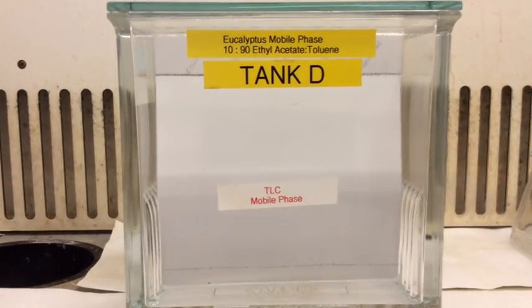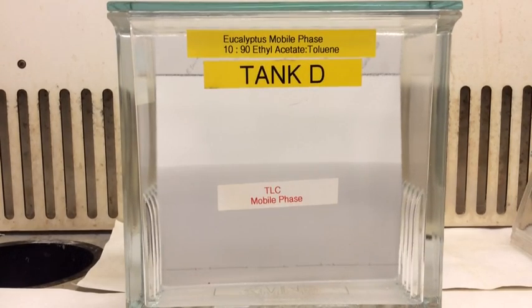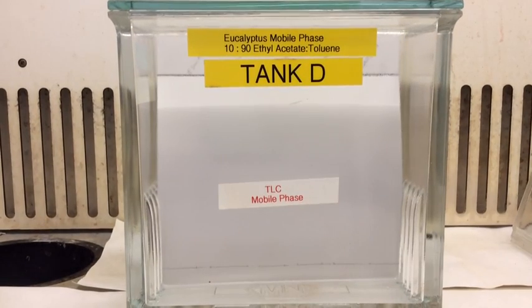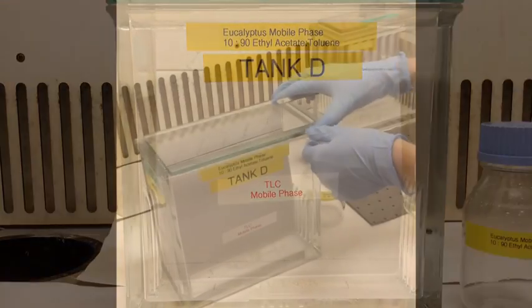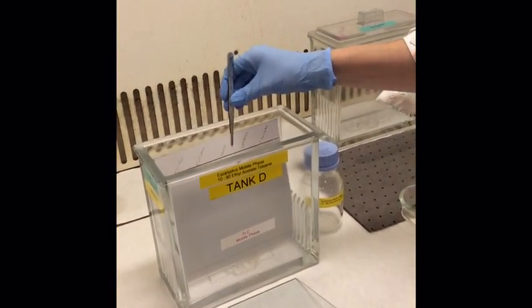Depending on the solvent system, it could take 30 minutes to an hour for the plate to fully develop. Once the plate has developed, carefully remove the TLC plate from the tank and allow it to air dry.